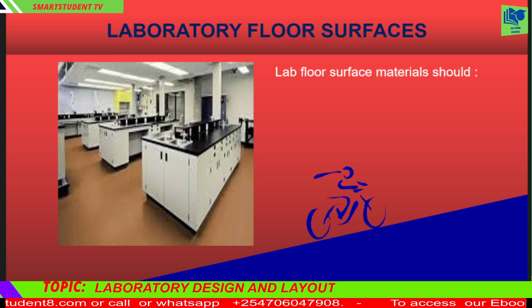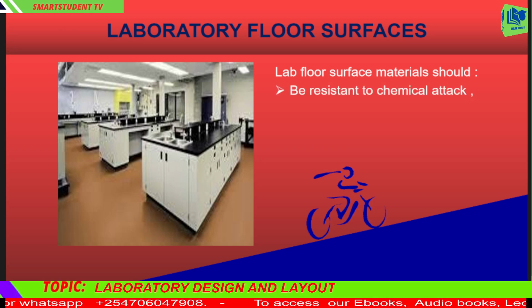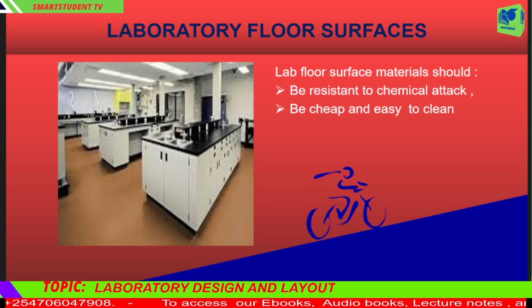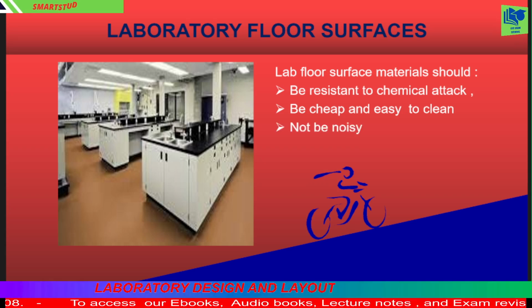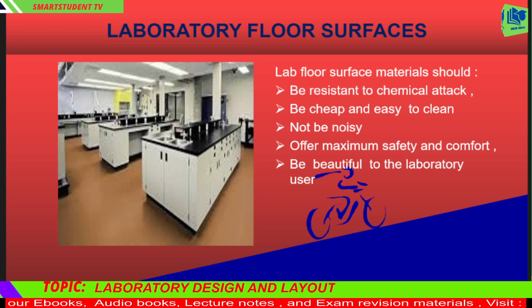However, some factors should be satisfied for it to be considered appropriate for use. They should 1. Be resistant to chemical attack. 2. Be cheap and easy to clean. 3. Not be noisy. 4. Offer maximum safety and comfort. 5. Be beautiful to the laboratory user.